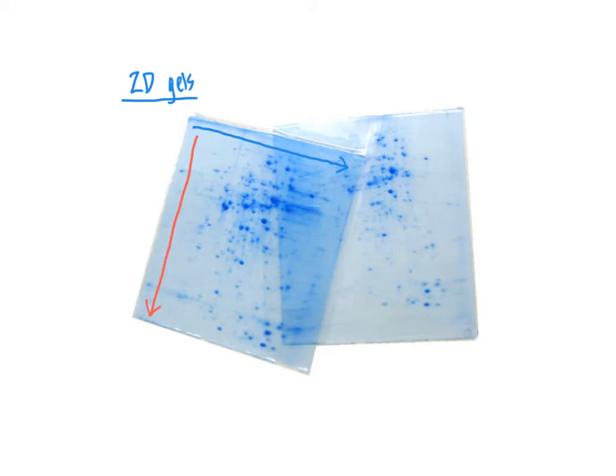So we can gain an idea about the molecular weight of each individual spot, where each individual spot represents a protein, and its pI point for our treatment compared to our control. Now, given the large number of spots here and the large number of different intensities of spots, it's generally not particularly possible to compare these two gels globally without using some sort of software.